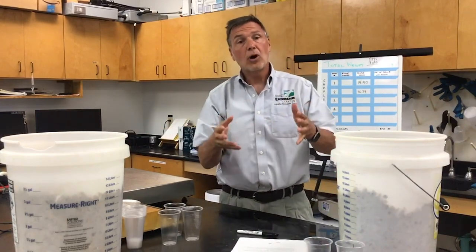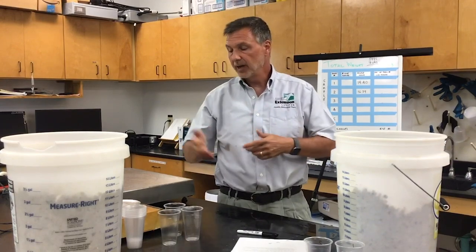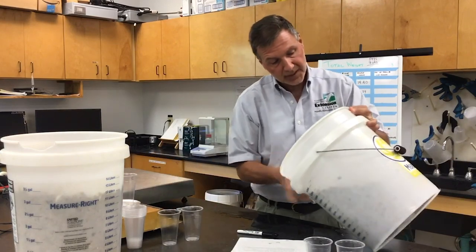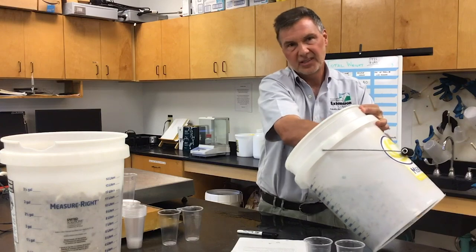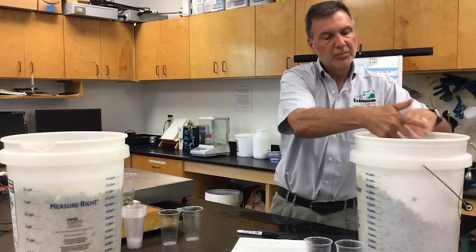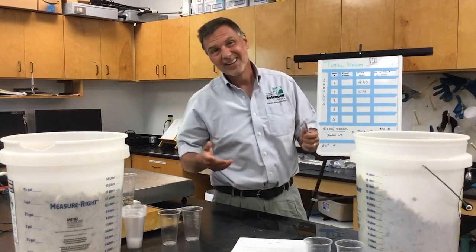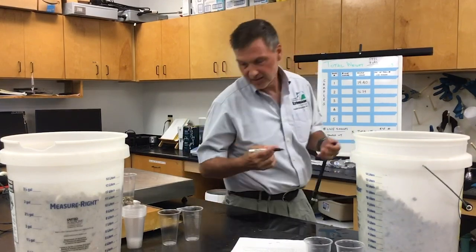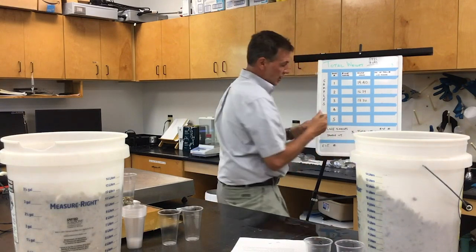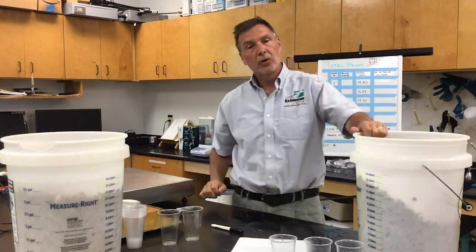I'm going to do the next three samples — 3 through 5. I'm grabbing handfuls from different parts of the bucket to make sure I'm not missing some on the bottom that might be a different size. You have to decide what's an unreasonable amount, but if we start counting 200 oysters or more in a sample, that's probably too many. The third sample is going to be 17.30 grams, and then I'll do the next two samples.